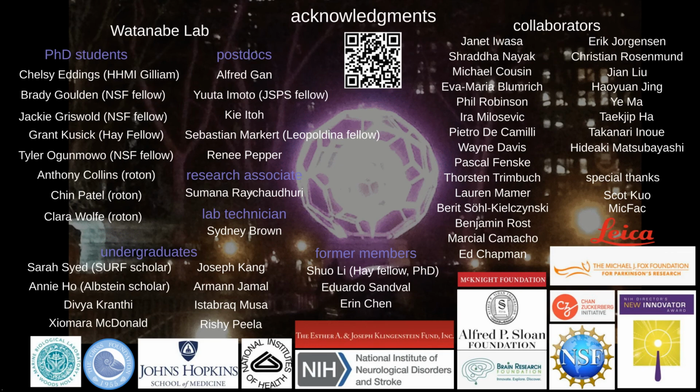In my case, zap and freeze was enabling as a technology over flash and freeze because of the added temporal precision. Obviously that's not going to apply to all experiments. If you want to look at transient docking, you have to do zap, as far as we know right now. But for other things, especially if you're freezing at longer time points, everything looks similar. For example, we've investigated ultrafast endocytosis with zap, and it looks just like it does with flash.